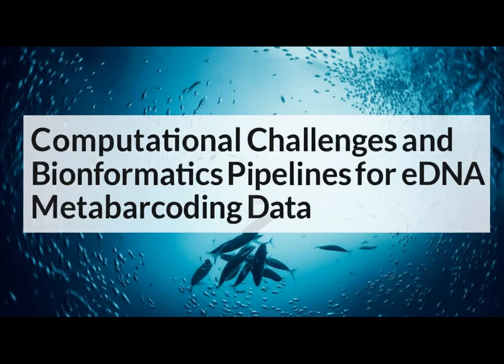Hello and welcome. Today, we're diving into the fascinating world of environmental DNA, or eDNA. Specifically, we'll explore the computational journey that takes raw genetic material from water, soil, or even air, and turns it into valuable information about biodiversity.